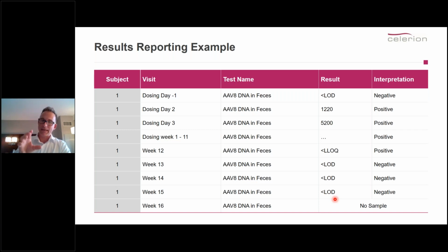But planning of this is not too difficult, because you know when dosing happened. So in this particular area, I'd say between, I don't know, week 10 to 30, this is where the turnaround time for those assays needs to be super fast and quick, and you need to look out for those. Again, once you're prepared for it, once you plan for it, it really is not a big deal. If you're not familiar with the unique requirements of a shedding assay, this can catch you out possibly.